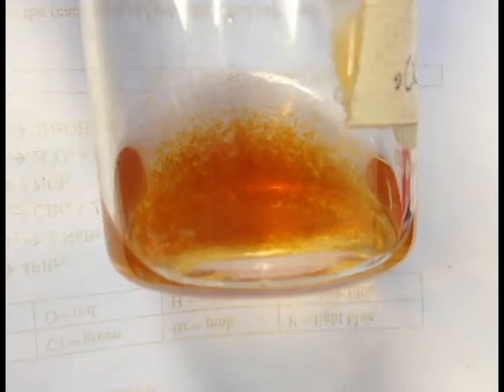Another thing was the precipitant. Why was the liquid still yellow in our after lab? Shouldn't all of the iron have precipitated? The answer was most likely yes. We just had no time to film it for long, but if we left it out for another few minutes, I am pretty sure that there would be no yellow or red anymore, just a clear liquid and an orange precipitant.